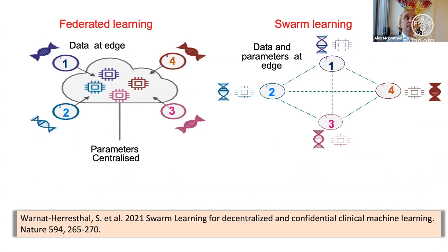And then there are other ways, federated learning, where everybody sends in their spectral models, and you make universal models from the different spectral models. In that case, you don't ever hand over your data to anybody, but you make a federated spectral model. And I don't think that's been tried at all. I think that's a good way for us to investigate in GLOSOLAN. To me, that would be a very good thing to do.